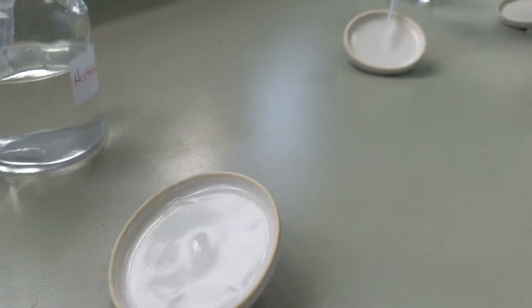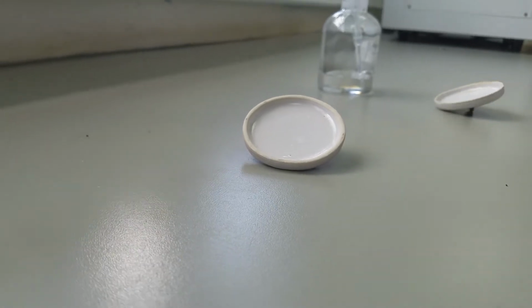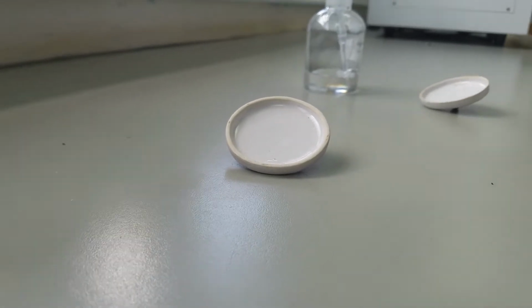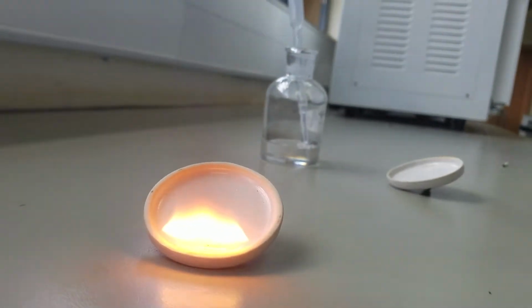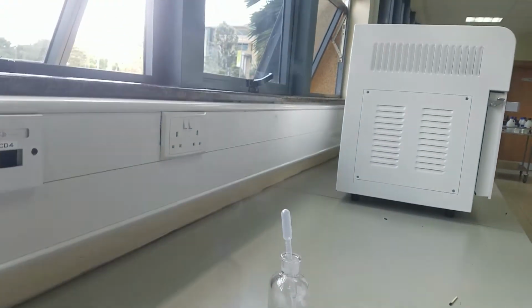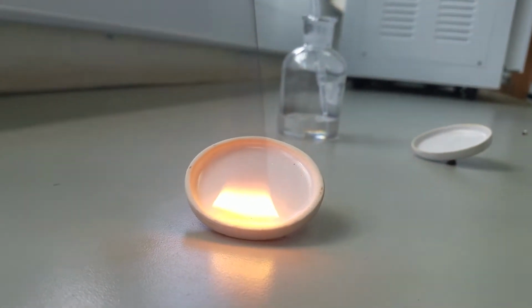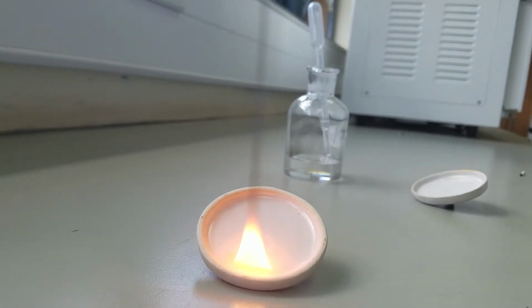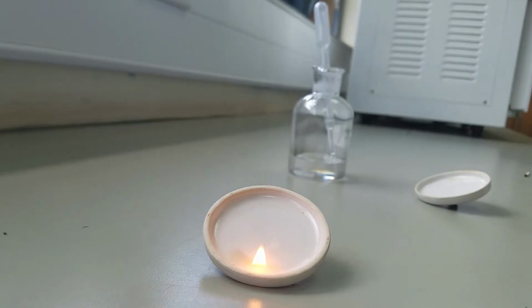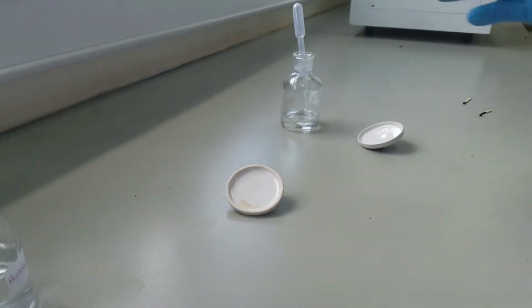I'll also put very few drops, 1 or 2 like that, and then I'll also light. Observe the difference. Good. So you are able to see the two flames. You should be able to explain what happened.